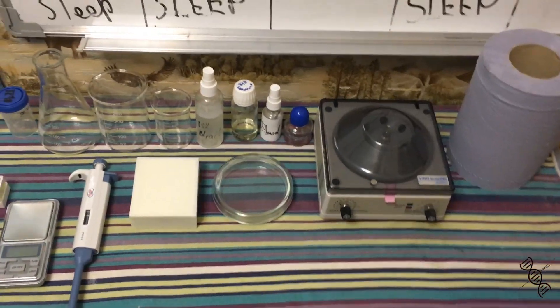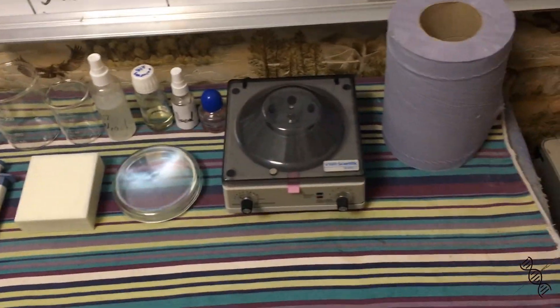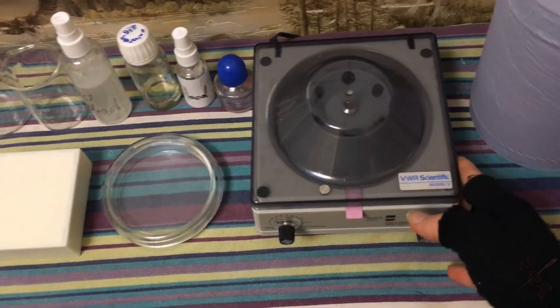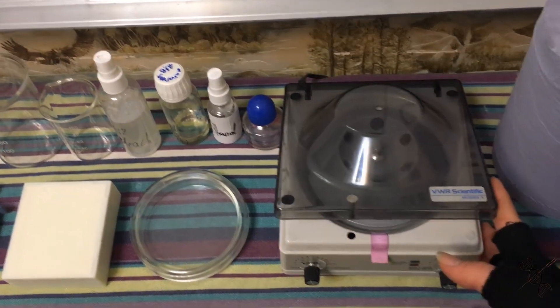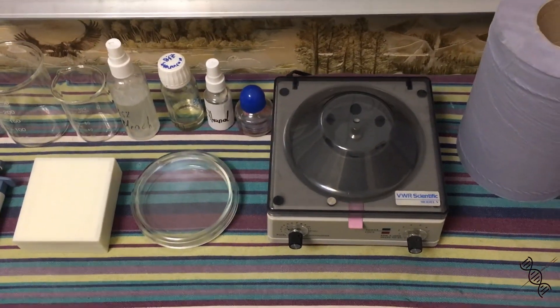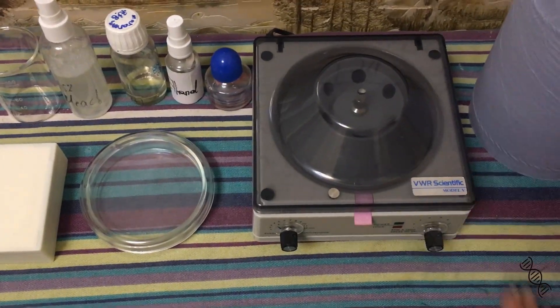Let's begin with my working place, where I do some biowork — the table where all the stuff is placed that I occasionally or non-occasionally use. First of all, it is my microcentrifuge, my little boy. This boy costed like 80 bucks, which is really cheap compared to other microcentrifuges. It works very well, so I'm really proud of this big boy.